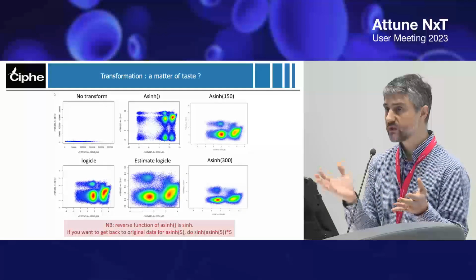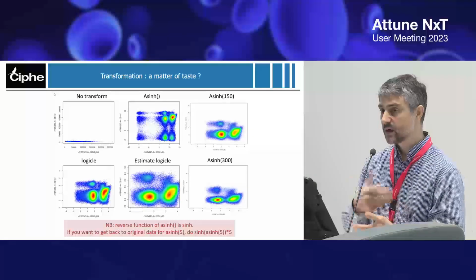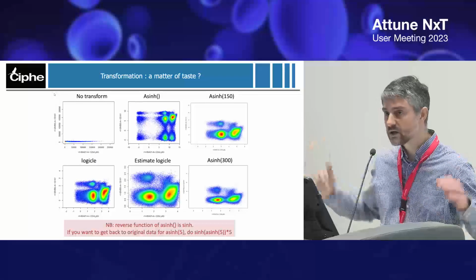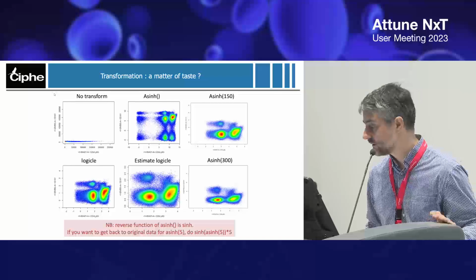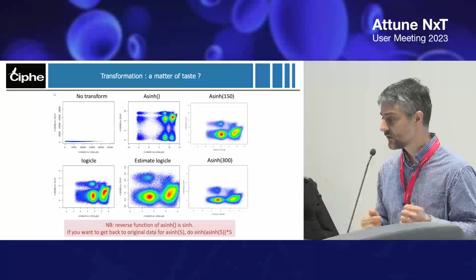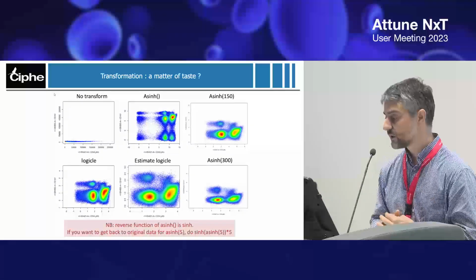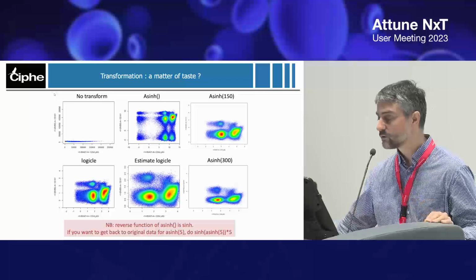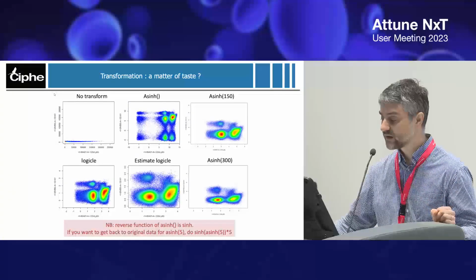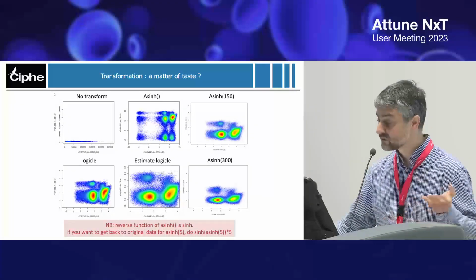If you don't scale your data properly, your analysis will be completely driven by the parameters with a very large intensity range. So the first thing you need to do is scaling. Here I put an example of scaling in fluorescence cytometry. It's so important because when you use an algorithm and do not transform the data, that's what the algorithm is seeing, and it sees no structure.